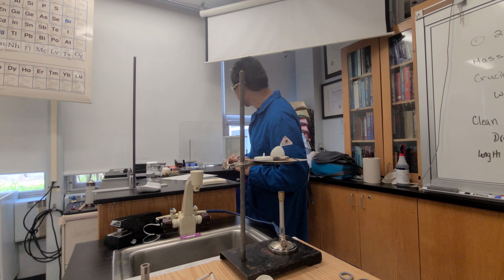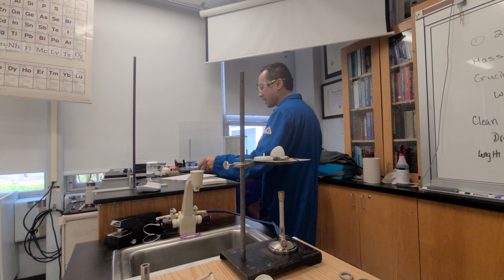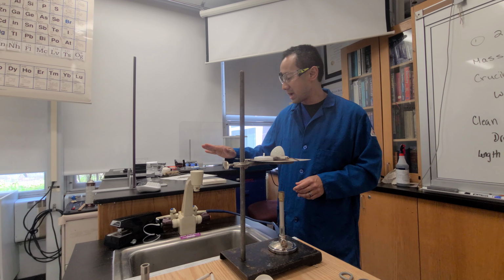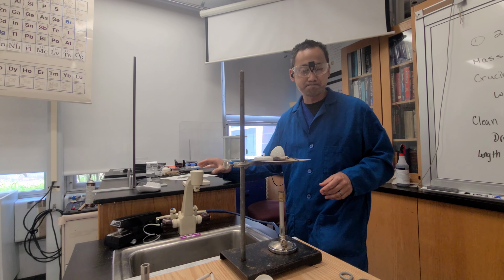Okay, so here it is. I'm going to weigh it out. I've already put my mass on there, so there it is. I am going to light this up to start heating this up, and I'm going to be placing all my hot stuff on this ceramic disc, ceramic plate, spot plate here, okay?